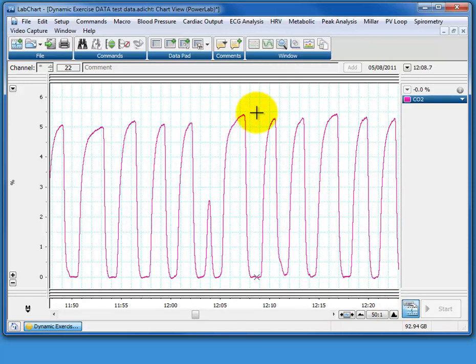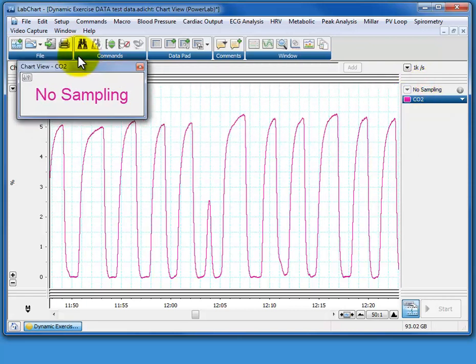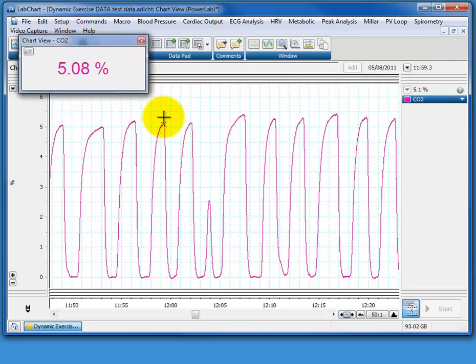If we wanted to summarize these numbers by reporting them as a mean end tidal CO2, for instance, at the end of a protocol for the last 10 seconds or throughout the protocol, we could do it by simply holding our mouse over each of these points and making a note of the number that appears in the top right here. We could drag a little DVM window and copy it down onto a piece of paper or type it into Excel, and we could get our end tidal CO2s very accurately. It would be accurate, no doubt about it.